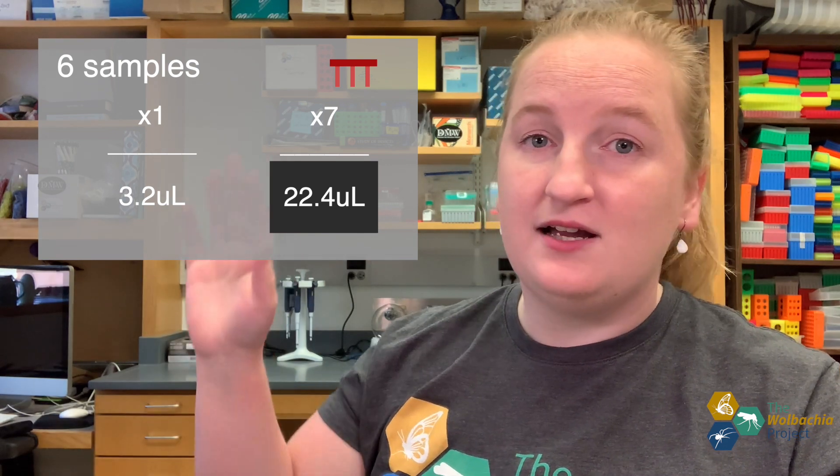When I'm done making my cocktail, I then aliquot and move exactly the amount of liquid I need to the DNA in my PCR tube. And that's a lot easier and more accurate than adding every single ingredient to the tube.